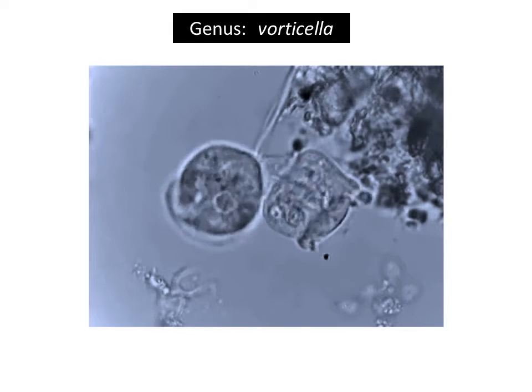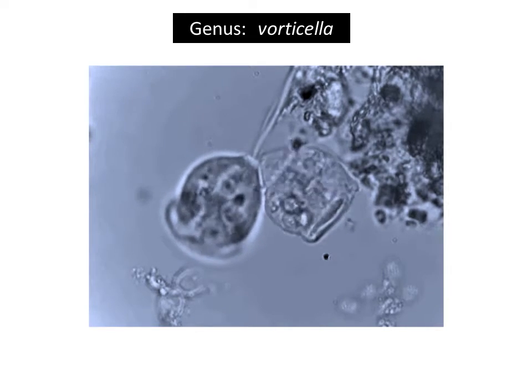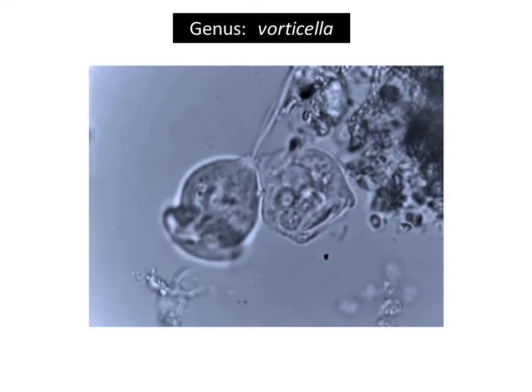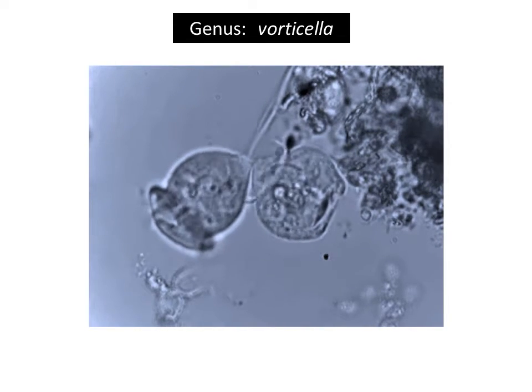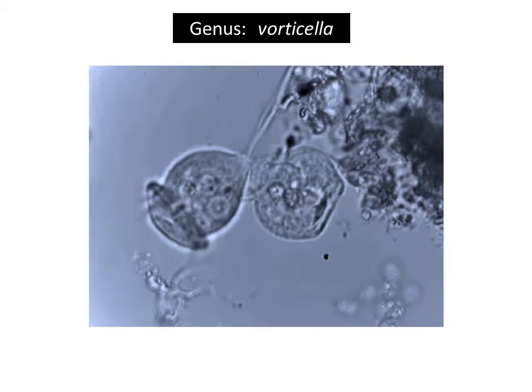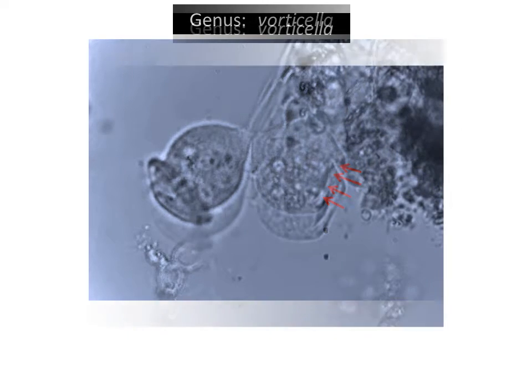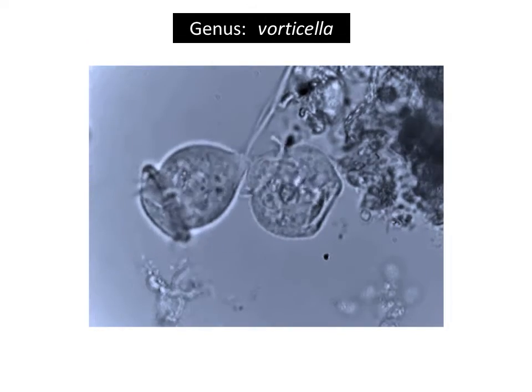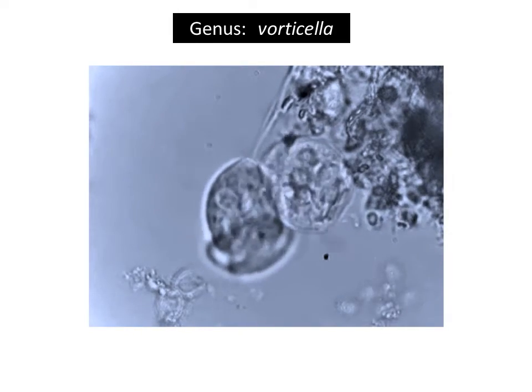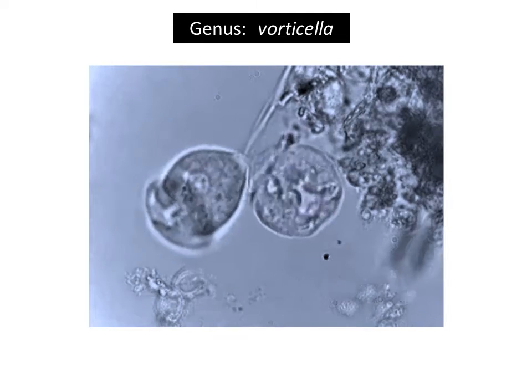Now the daughter cell begins to independently contract, and towards the end of its contraction, we see that it has withdrawn and inverted its oral ciliary structures. The organism is rounded, the mouth appears almost sealed, and the wreath of basal cilia is coarse and hyperactive.